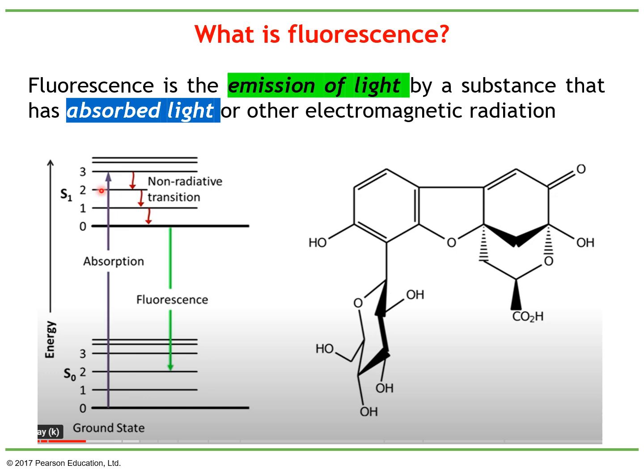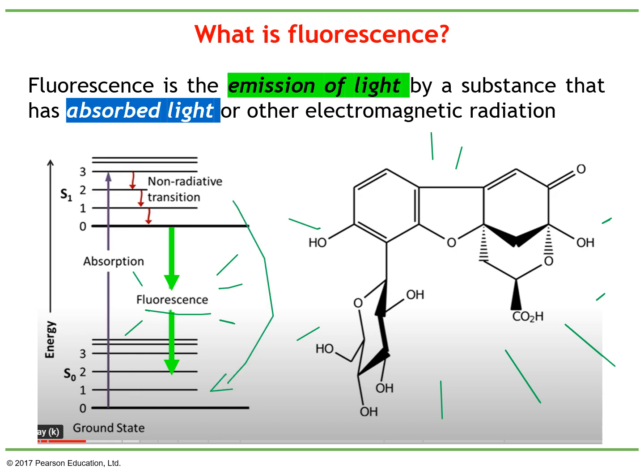Here you need to understand a little bit of energy, and here you have this compound. What is happening, let's put it in green here, is that for some reason a chemical starts becoming fluorescent and starts emitting light. This is what we see. We see that this is emitting light, and what happens here at the energy level is that it is not producing high energy, it's actually emitting low energy. Here you see the process. When you see that something is fluorescent, the electrons are going from a high energy to a low energy, from an unstable state. Good.